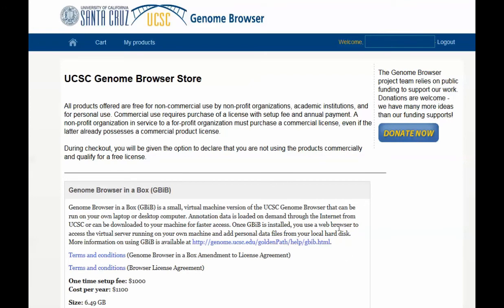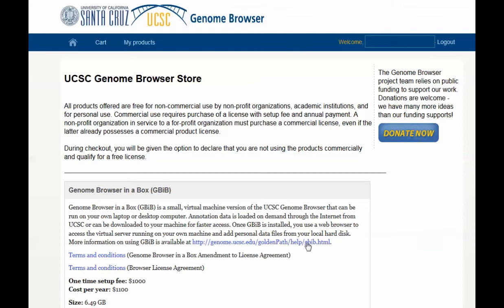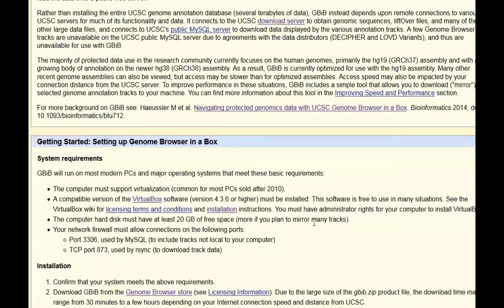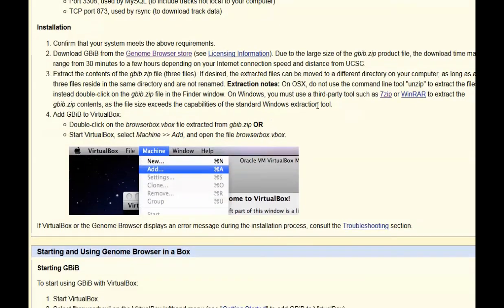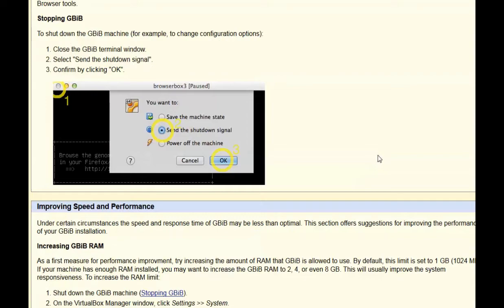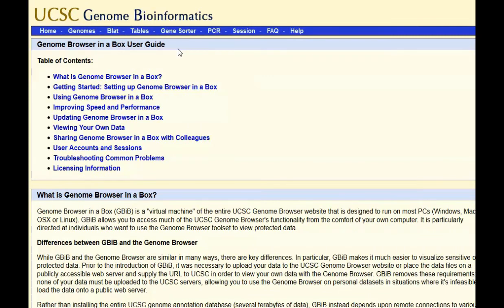If you have downloaded the software and agreed to the license terms, the next thing is to access the details on how to get started. The best place is the help documentation available on the site. There are key points about setting up VirtualBox. The extraction can be challenging — it might not work with the software you have. I had to download an additional tool because of the heavy lifting required; it didn't work with the unzip tool I had. There are a bunch of other helpful getting-started tips in the user guide, so be sure to find your way to the Genome Browser in a Box user guide.